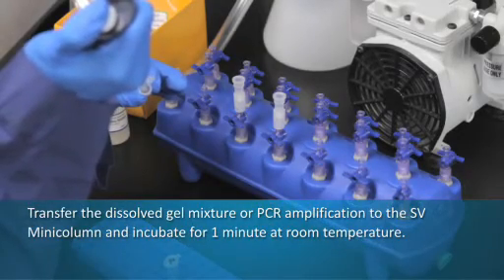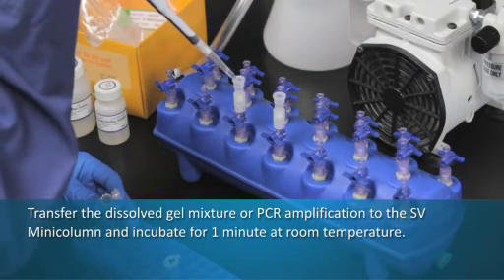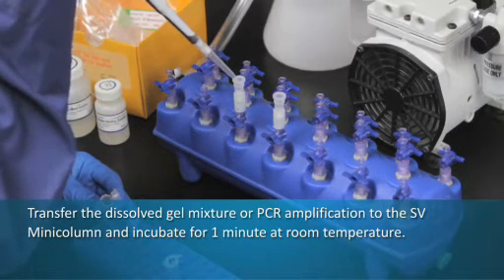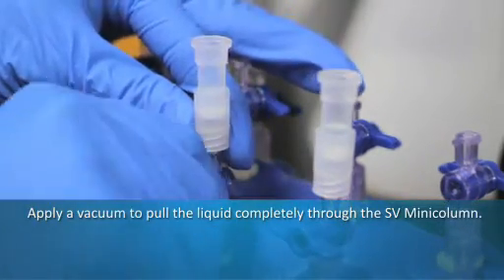Transfer the dissolved gel mixture or PCR amplification to the SV mini column and incubate for one minute at room temperature. Apply a vacuum to pull the liquid completely through the SV mini column.